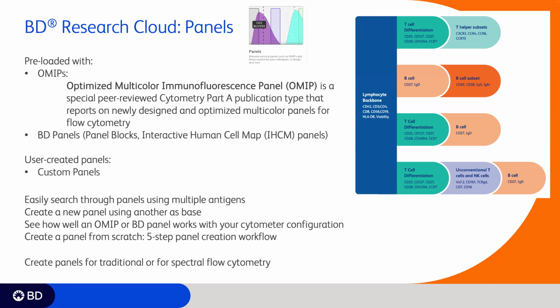You can create panels for both traditional or spectral flow cytometry, or if you happen to have the FACSDiscover S8, the latest BD flow cytometer that also has an imaging component, you can design imaging spectral flow cytometry panels in there as well.